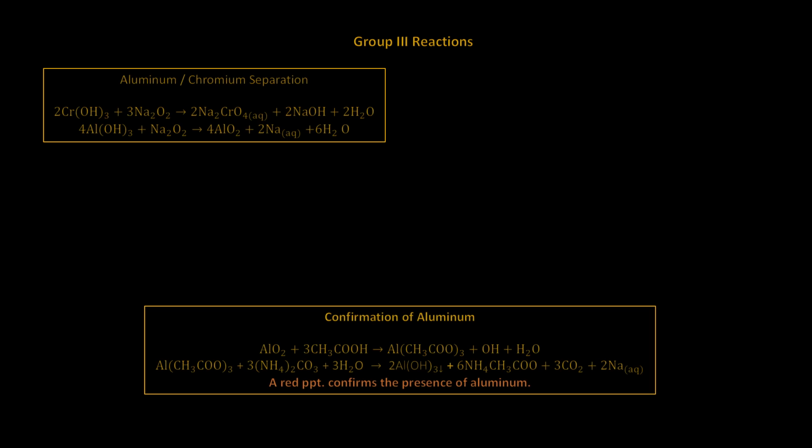The iron and manganese will have to be separated. Keep in mind the only iron that may be present will be ferric iron, or iron 3. Adding sodium peroxide to the precipitate forms a precipitate containing the ferric iron and the manganese. Both are not soluble as hydroxides in a peroxide solution.